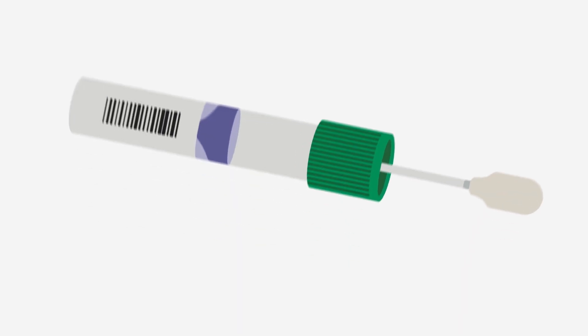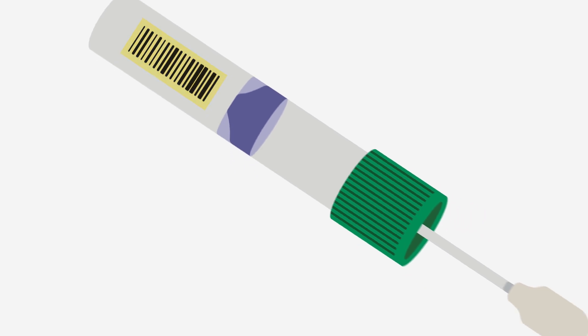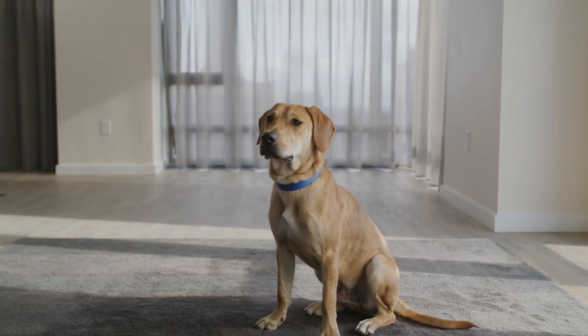Your dog's MBARC journey starts with a cheek swab. We track this DNA sample through the whole process with a unique ID found inside your kit. But before we go any further, here's a quick primer on DNA.